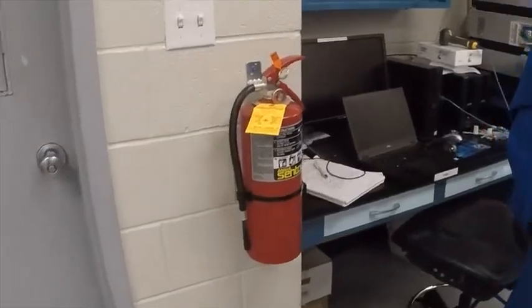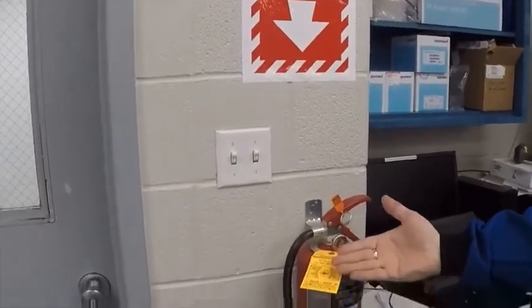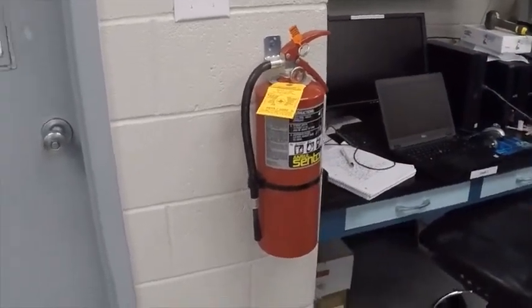Another common safety device in your lab is a fire extinguisher. Fire extinguishers should be in a convenient location, should be labeled so they're easily found, and should be inspected annually by your fire provider and monthly by a safety professional. A fire extinguisher is used only to save yourself — if you're not comfortable using it on a large fire, it is not required. It should only be used for putting out small fires and to get you to safety. If you have a fire, get out, notify your safety professional or security force immediately, or call 9-1-1 to get the fire department there as soon as possible.